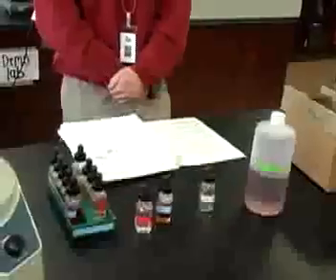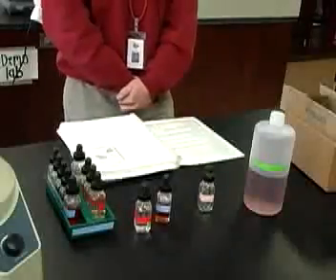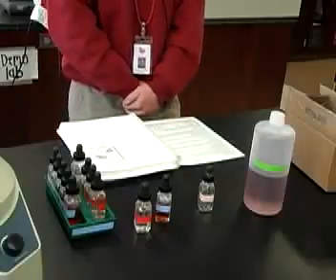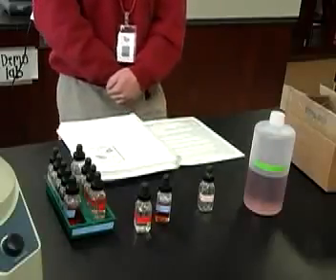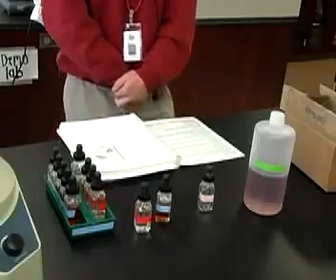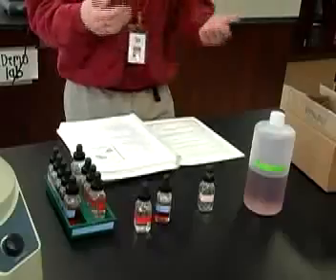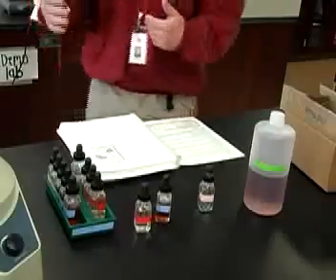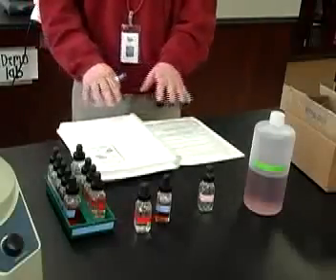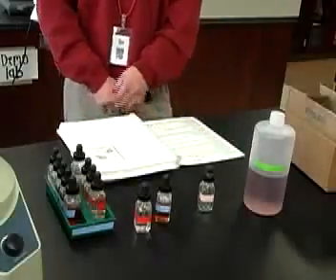Generally, measuring solutions. Generally, you should estimate the volume of the solution that you add. Notice it said estimate. It's not necessary to use a graduated cylinder to measure the solution volumes. You might wish to calibrate a test tube in milliliters just to give yourself an idea of what a volume of a milliliter actually is. You may also want to count the number of drops in a milliliter. The general rule of thumb for these droppers is 20 drops is about a milliliter. But they usually just tell you to add 2 or 3 drops. And since the name of this lab is called qualitative analysis, not quantitative analysis, what you really want to know is what is actually in the solution, not how much is in the solution.